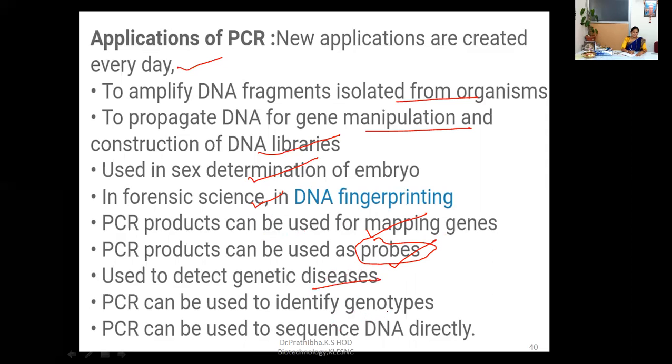PCR can be used to identify genotypes. PCR can be used to sequence DNA directly.